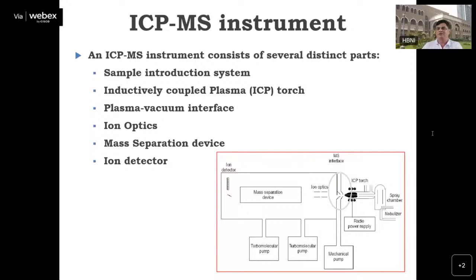For example, the various detection limits in the manual, for example ICP-OES. In ICP-OES, the various detection limits have been given for the various elements which are possible to analyze using ICP-OES. Then one can use those ideal conditions. Ideal condition means the condition prescribed in that particular protocol, and definitely one can meet that detection limit.